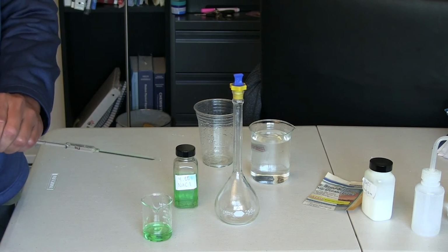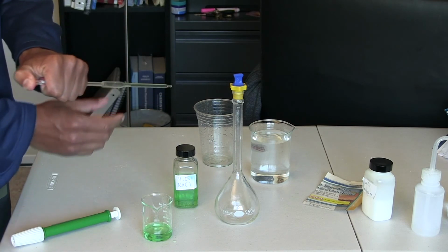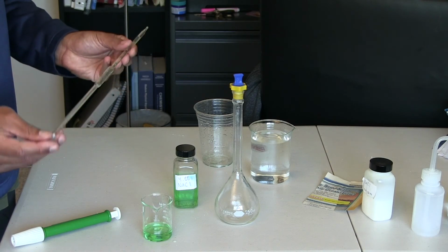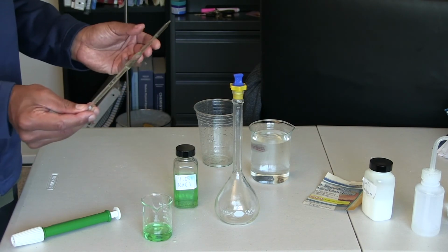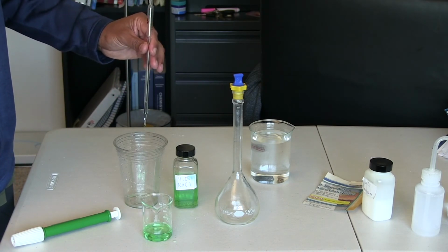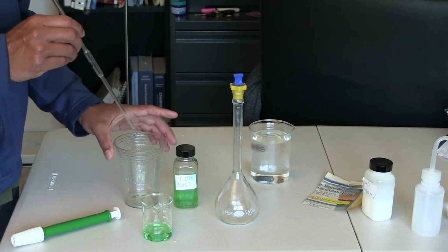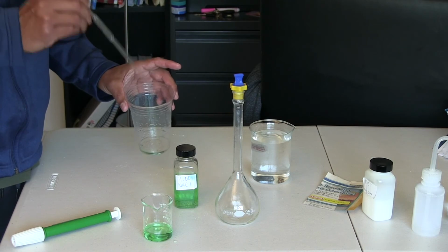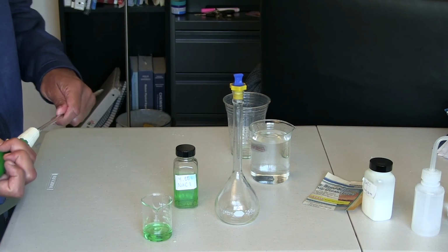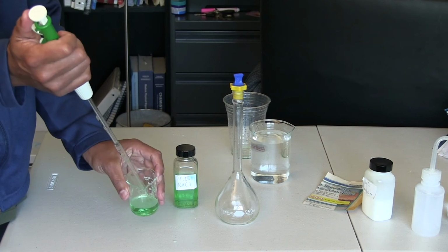So what I'm going to do now is remove the pipette filler, and I'm going to make sure that I rinse the inside of the pipette by doing this. And then here, this is going to act as my waste container, and I'm going to let it pour into the waste container. Normally you're supposed to do this at least 2 times. Now I can attach the pipette filler here, and now I'm ready to withdraw the liquid that I need.